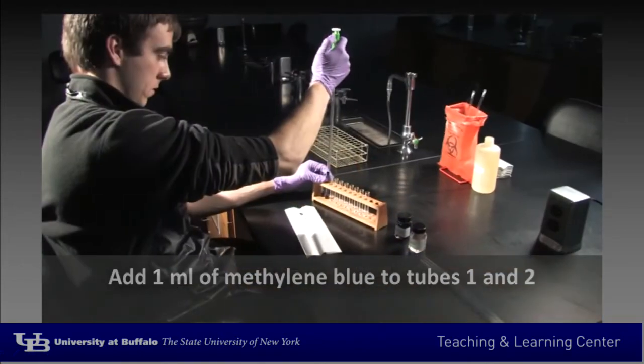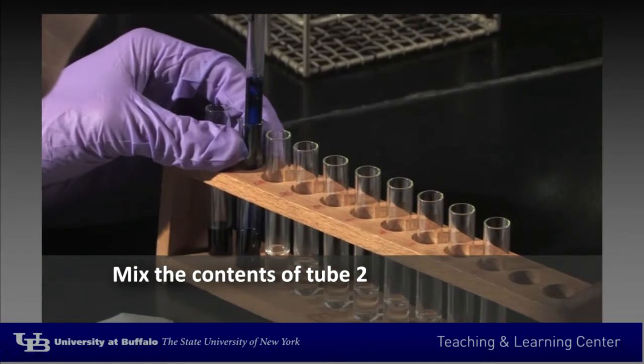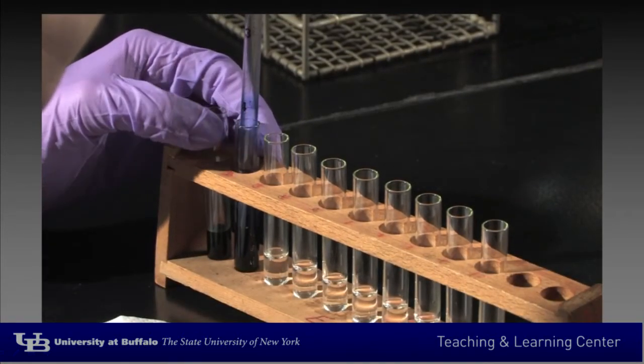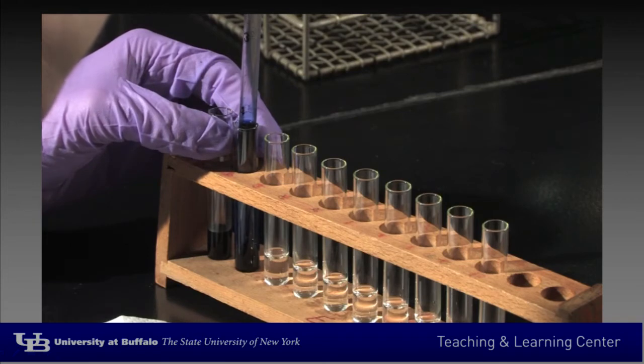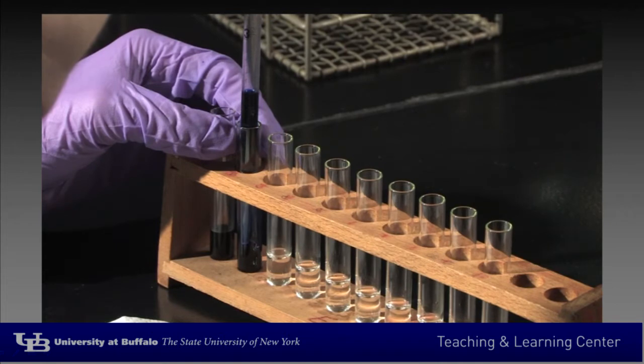With the same pipette, mix the contents of tube 2 by drawing the contents up into the pipette. The process of drawing up and dispensing out is considered to be mixing. To mix thoroughly, this should be repeated a few times.